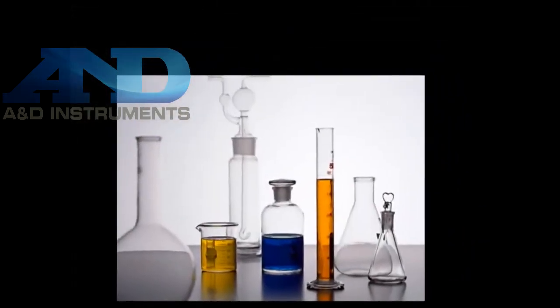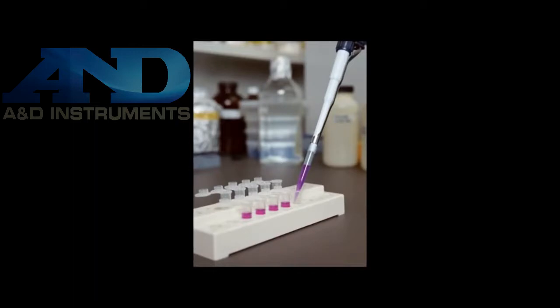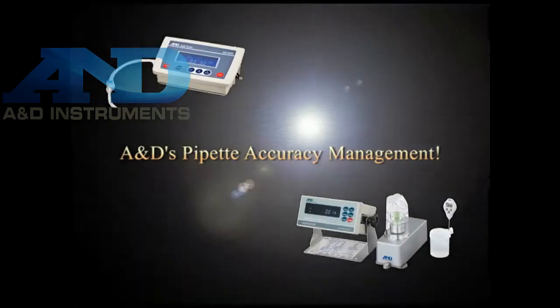You understand the importance of managing pipette accuracy in laboratories, factories, and educational institutions. But how can you actually manage it in your workplace? Is there a simple and precise way to verify the performance of your pipettes that doesn't require outsourcing and substantial costs each time? Yes, there is a way. A&D's Pipette Accuracy Management.